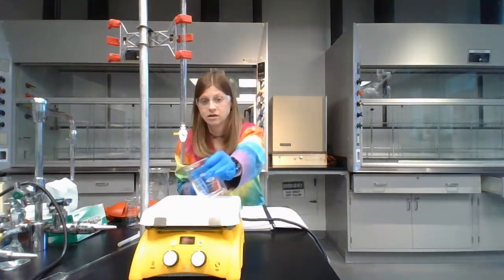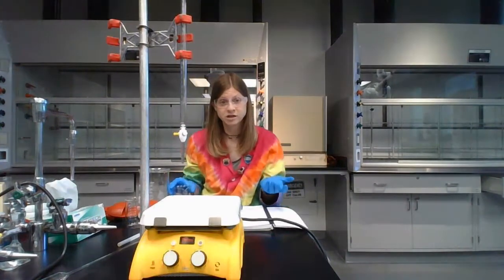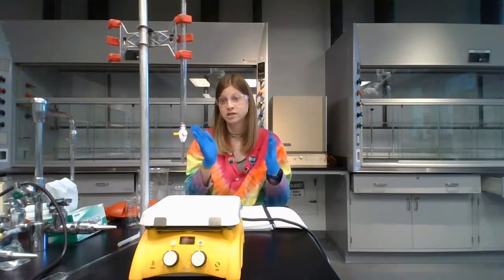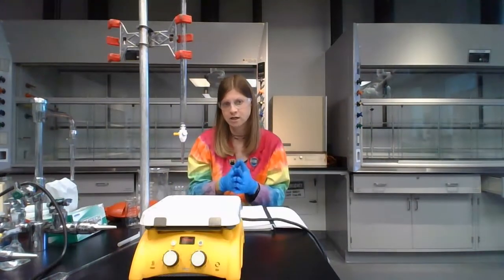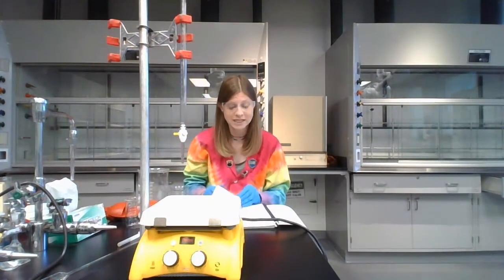At the end of that trial, once it's turned that light pink color and it stayed for 15 seconds, take it off, remove the stir bar, rinse it, dry it, put it in solution 2, and then make sure it's at 70 to 90 degrees Celsius and repeat the titration. You're just going to do that for trial 1, trial 2, and trial 3 in part A, where each time you're going to see the dark purple color show up and then disappear. And then the second time you start seeing a color is close to the endpoint, and we're going to stop it as close to the lightest pink purple color that we can get that stays for 15 seconds. So you'll record the initial and the final value of your burette each trial.